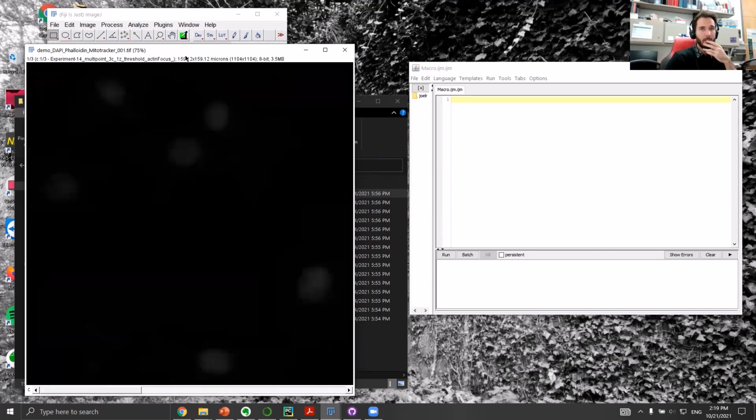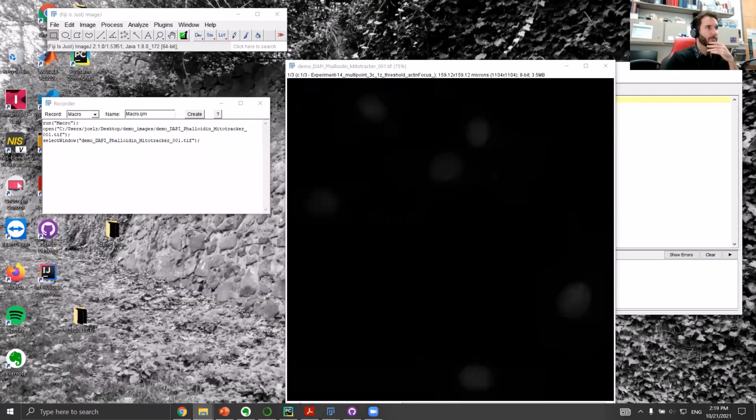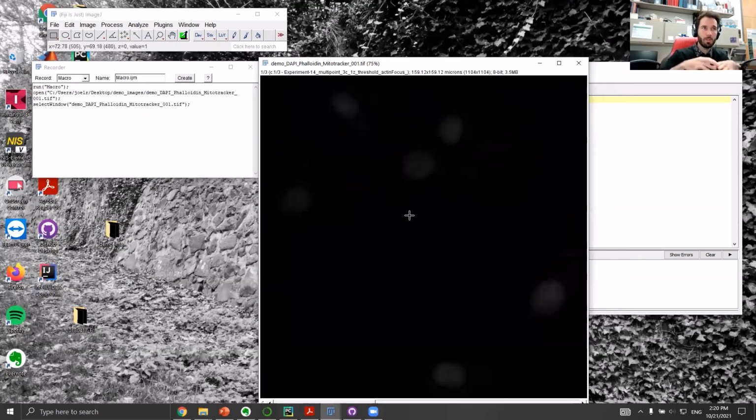I'll go back. What we're going to do is sequentially set the color for each one of these channels. Currently they're just displayed in black and white, and we're going to make them each a color that makes more sense to us, and then we're going to make the composite image.